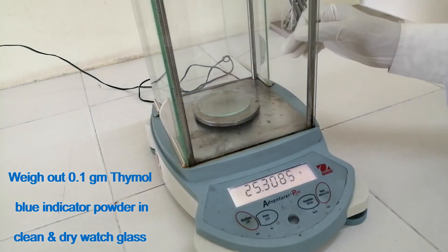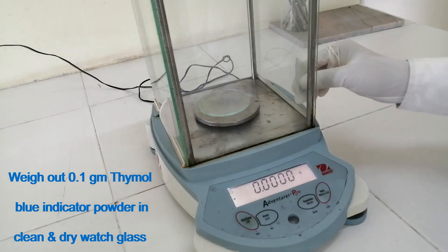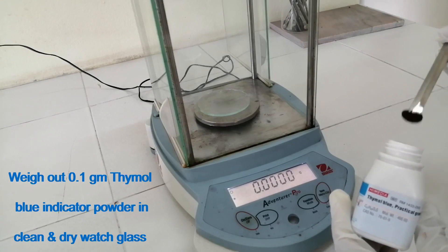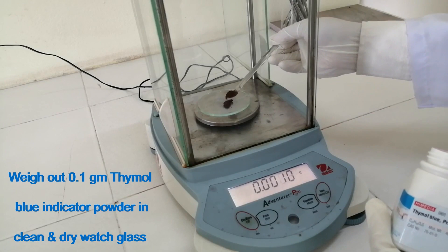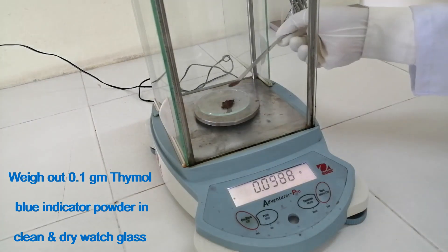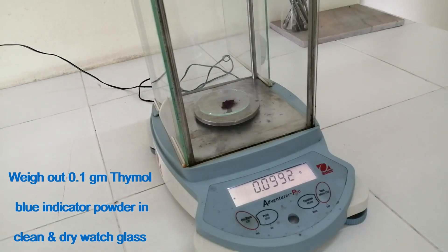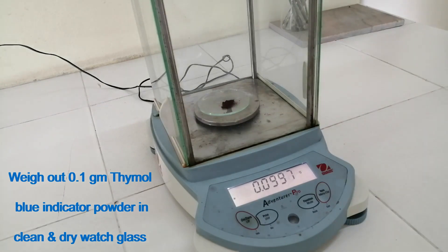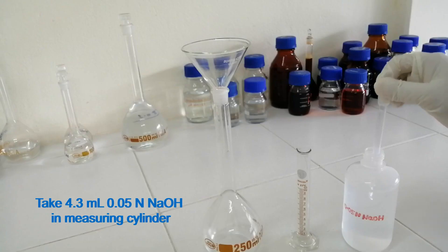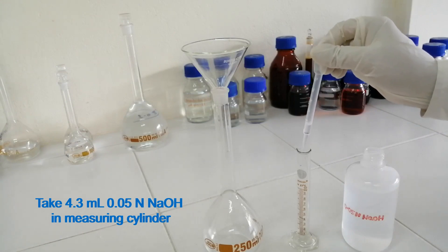Weigh out 0.1 gram thymol blue indicator powder in a clean and dry wash glass. Take 4.3 ml of 0.05 N sodium hydroxide in a measuring cylinder.